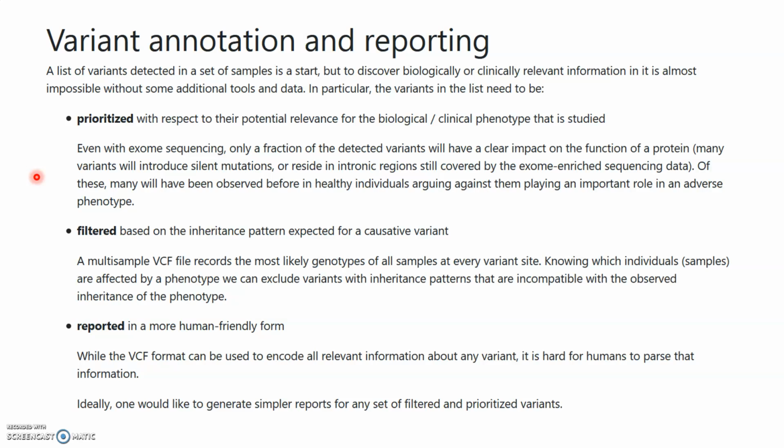So we want to prioritize those specific base pair changes that could possibly lead to our clinical outcome.